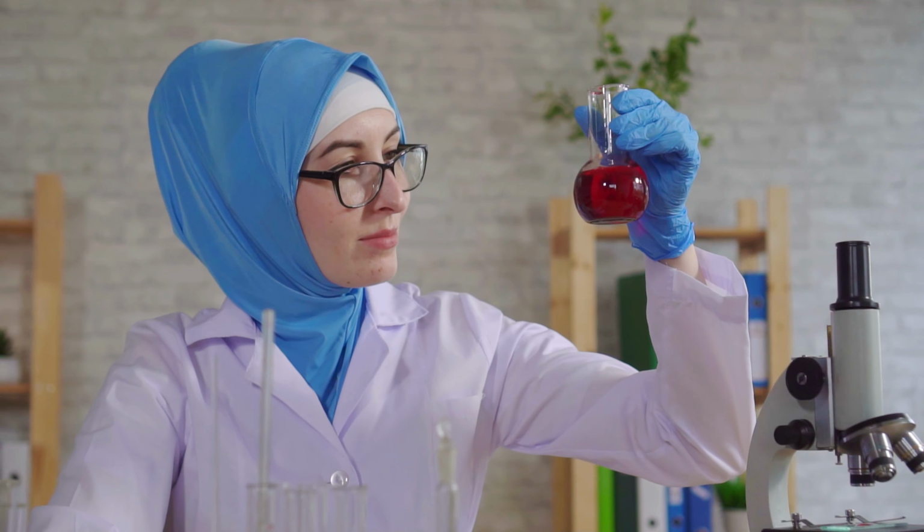Welcome to the first of our videos looking at key separation techniques used in chemistry. If you're starting your course from scratch, you might want to check out our overview video, which is linked above, because today I'm going to focus on just one of those techniques. And today I'm going to take you through the key aspects of the process of filtration in a chemical laboratory.